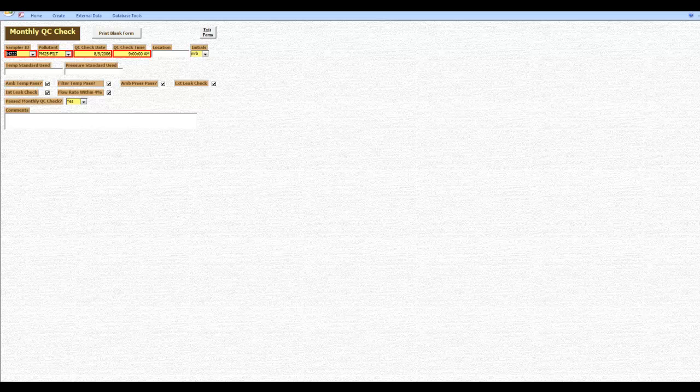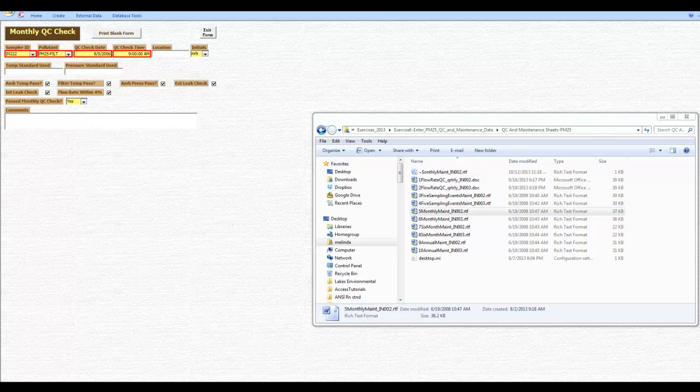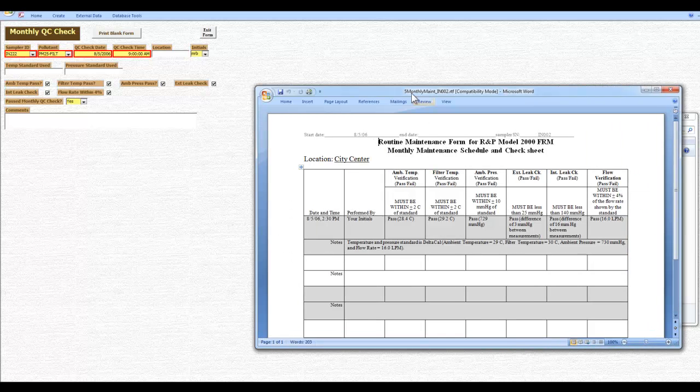So just looking at what is in the next set of checks, this is the monthly QC check, and it's really just monthly maintenance. So first for instrument 2, you could see that it's basically a sheet, and you might have this in your sampler box, and you go through and you put in this information. Will probably be in handwriting if you're doing such checks, and you should if you're doing filter-based PM2.5 checks. And one thing that's important to notice is it's always good to say more than pass-fail. It's always good to record the actual values.